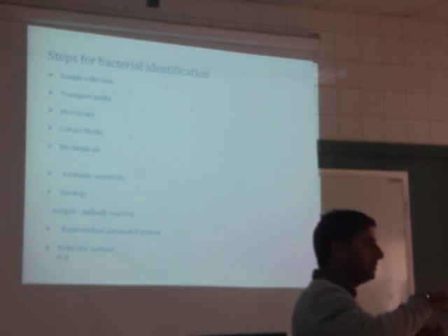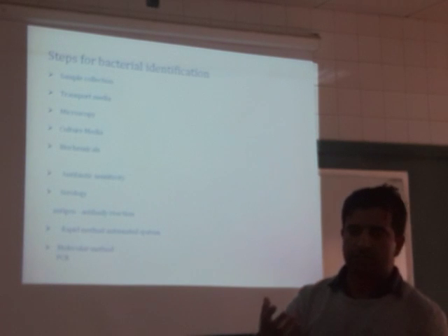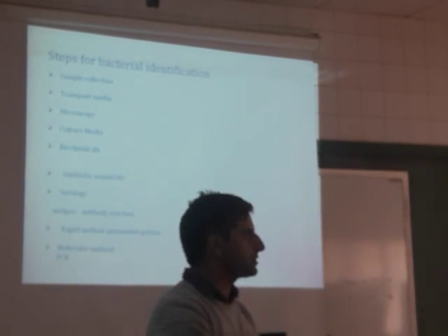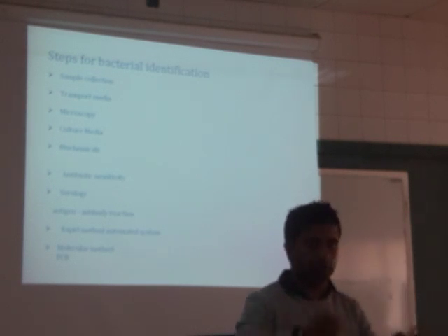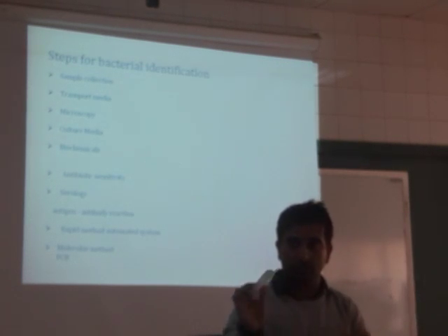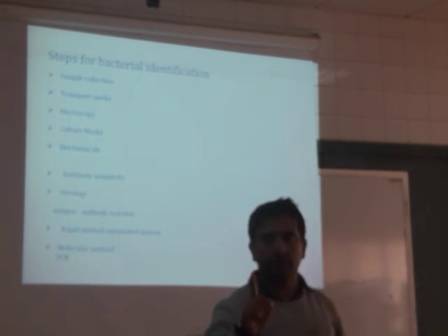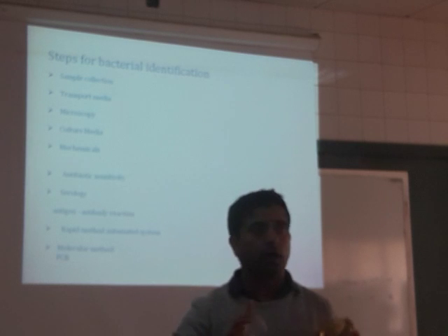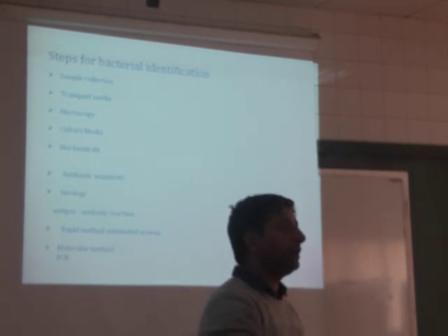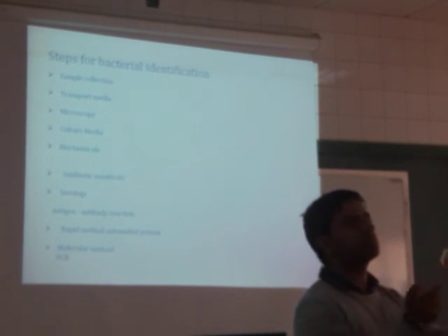Along with the agar, there are components like glucose. If we put the culture media here without agar, it will not stick like this. Because the job of agar is only to make this media solidified. It does not help the microbe to grow. Only the nutrients here help, but why do we put agar? To make this solidified.